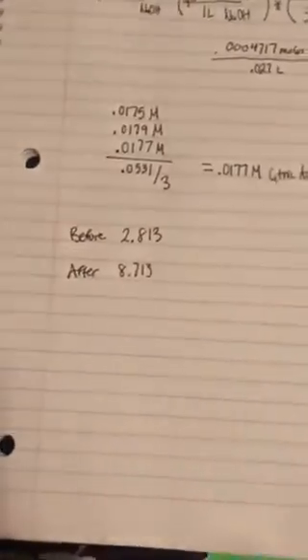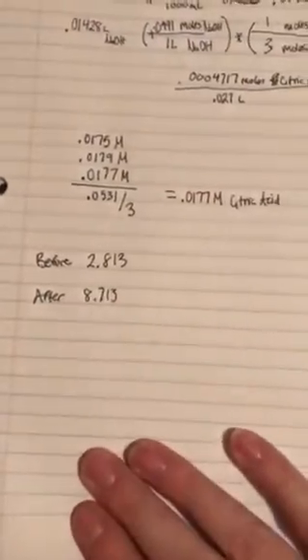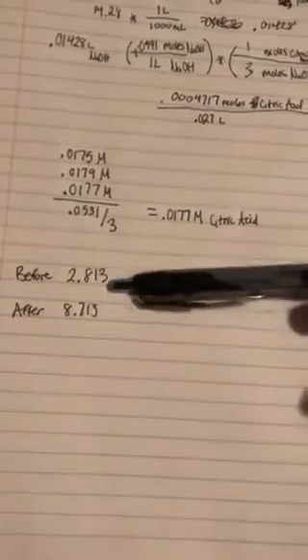Adding the base uses the neutralization to make the actual solution more neutral. As you can see, this one is very acidic and this one is pretty neutral, meaning this is what happens with the base added. To reference this lab report, I'm going to use my manual as a reference, and thank you for listening.